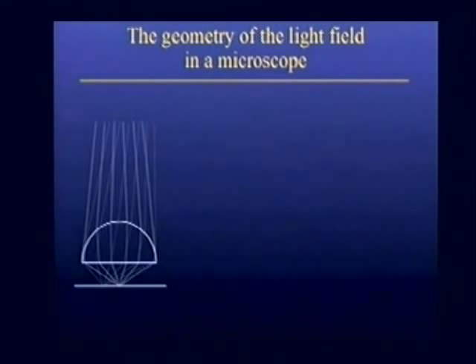And that's the way photographic cameras work. One way you can think about it, these are blur cones. A photographer would be comfortable with this. Things would be in focus here and would go out of focus if you move them up. A photographer would also say you can think of it as being a line of sight, which is the centroid of that cone, plus at each distance away from the in focus plane, some circle of confusion. So if you think of it as lines of sight and circles of confusion, what are the lines of sight of this photographic lens? Well, it's obviously the centroids of those cones, which look like that. They come together at a point. That point is the perspective viewpoint of the lens. And so it's on the first principle plane of the optical system.